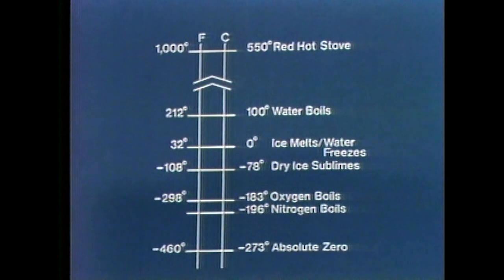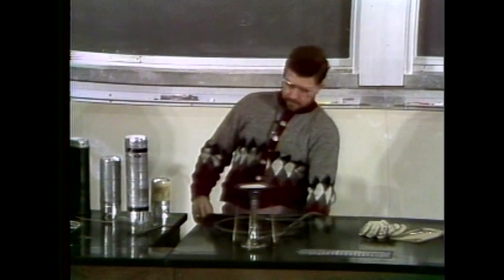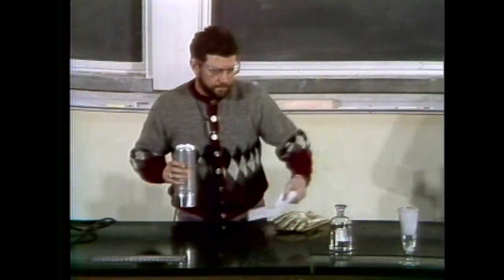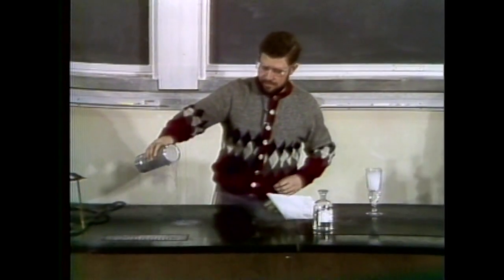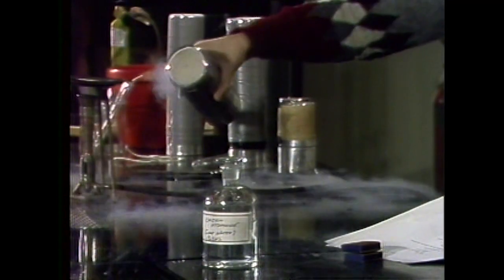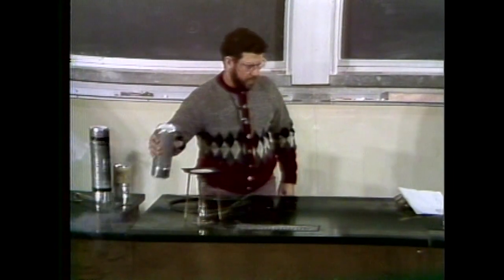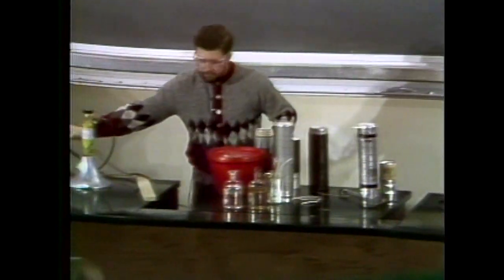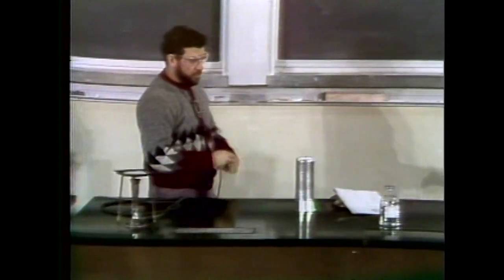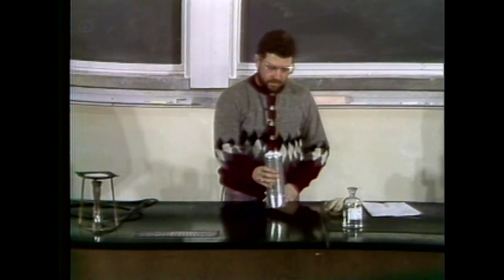One thing that we want to show you right away is what this liquid nitrogen that I'm talking about looks like. It's really a liquid, and as you can see, it dances around. In fact, it's a pretty good device for dusting the top of the table here. And so I want to clear the table here, so I'll do that. It's very cold because, as I mentioned before, it is at a temperature of minus 196 degrees centigrade.